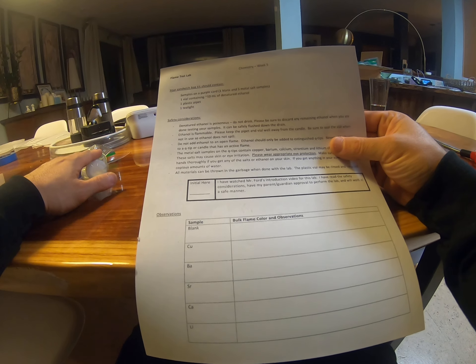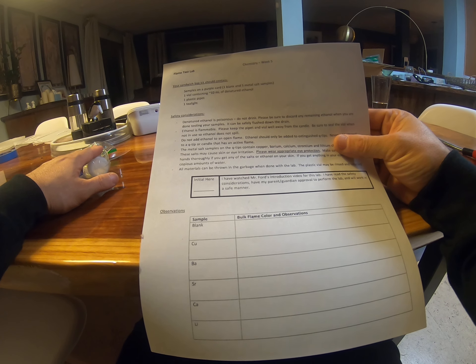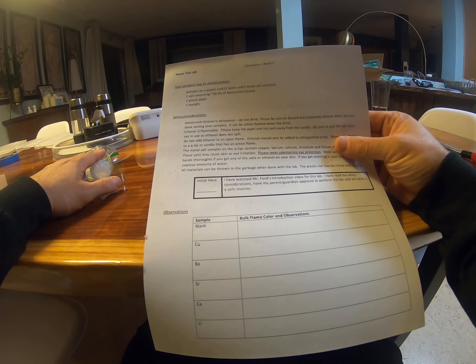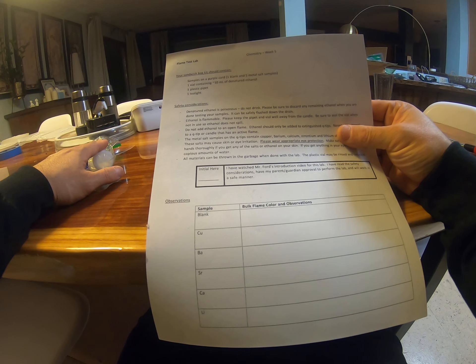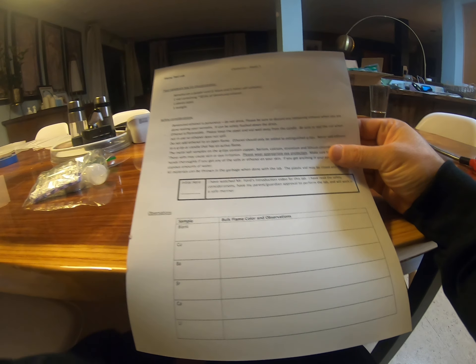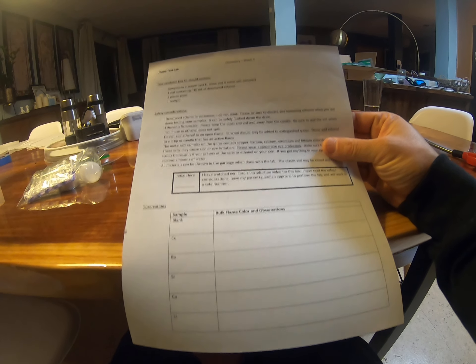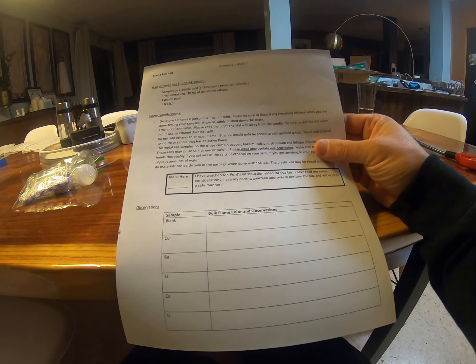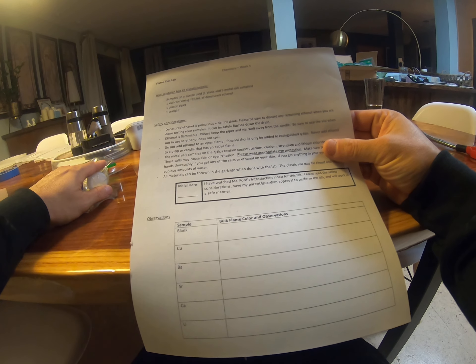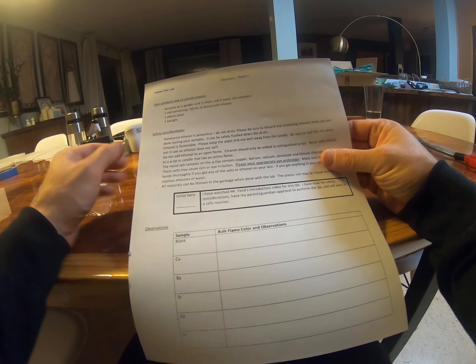It gives a little inventory at the top and I'll talk about that in a second. Safety considerations: we're going to work with ethanol. Ethanol is what's found in wine, beer, and liquor. However, this is denatured alcohol that I put in here. Denatured alcohol is not for consumption — it's actually got a poison added to it. So please do not drink it. Make sure you discard any remaining ethanol. Don't leave any in this vial sitting around somewhere. Get rid of it so that your younger siblings or somebody doesn't find it. You can just safely rinse it down the drain.